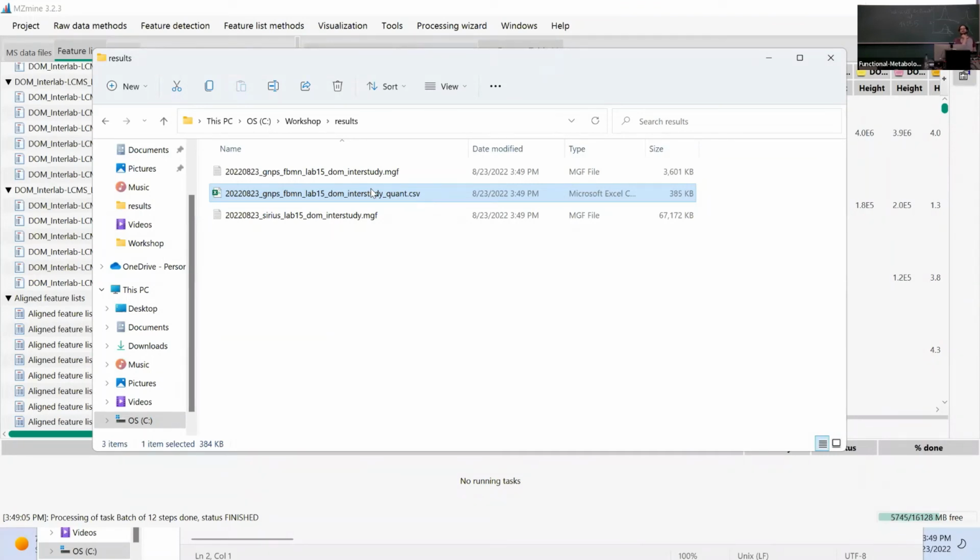Oh, it didn't. No, but I stick with my data, and then make more people maybe do a file and then all the... that's the exporting step. Oh, can we just look at the parameters?